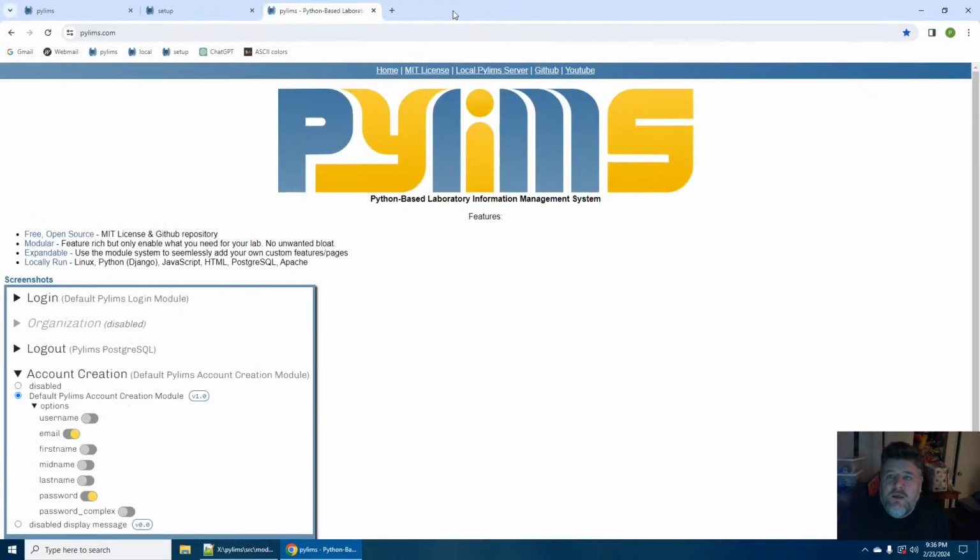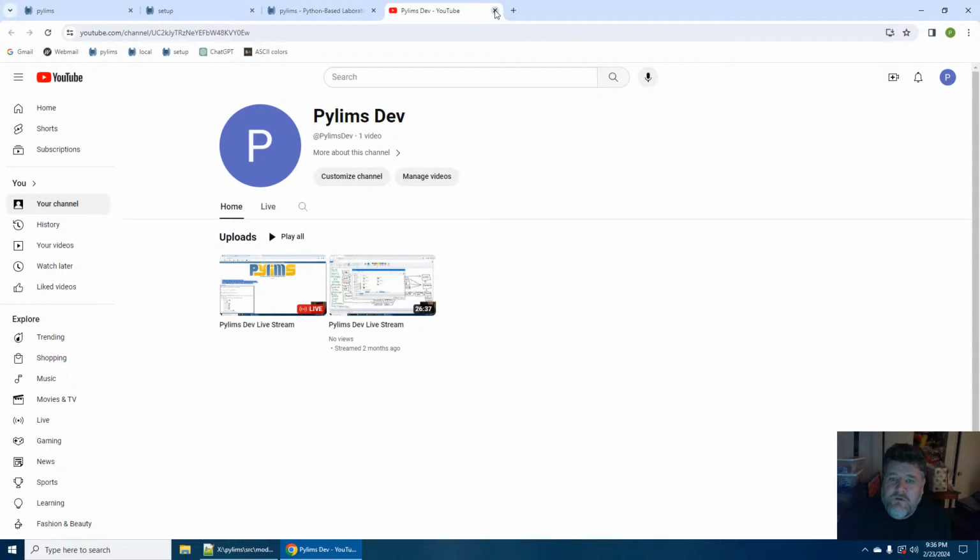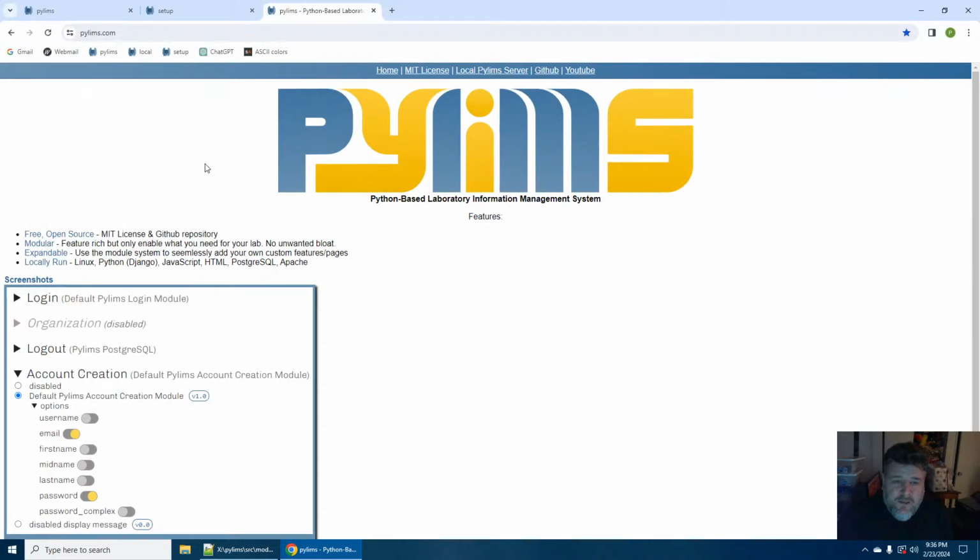And then a link to a YouTube page, which I don't know. Oh, look, it shows me right there. Okay. And that's it. So the main thing here that we'll be going over is the local Pylims server.